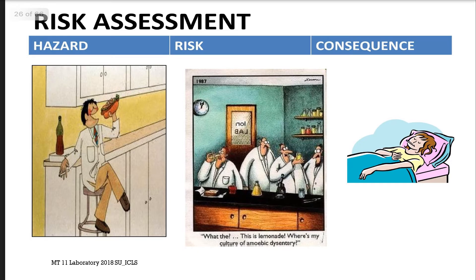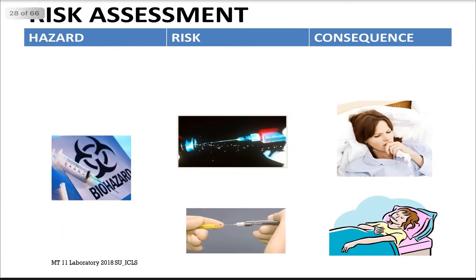These illustrations depict a perfect example of risk assessment involving hazard, risk, and consequences. In the first illustration, a laboratory scientist is eating a hot dog sandwich and soda inside the lab — a violation of general laboratory rules. In the second illustration, a scientist mistakenly drinks a culture of amoebic dysentery thinking it was lemonade, resulting in hospitalization as the consequence. Another example: using a needle for blood collection is a sharps hazard, and the risk involves accidental punctures, which could result in acquiring hepatitis B virus or other blood-borne pathogens.